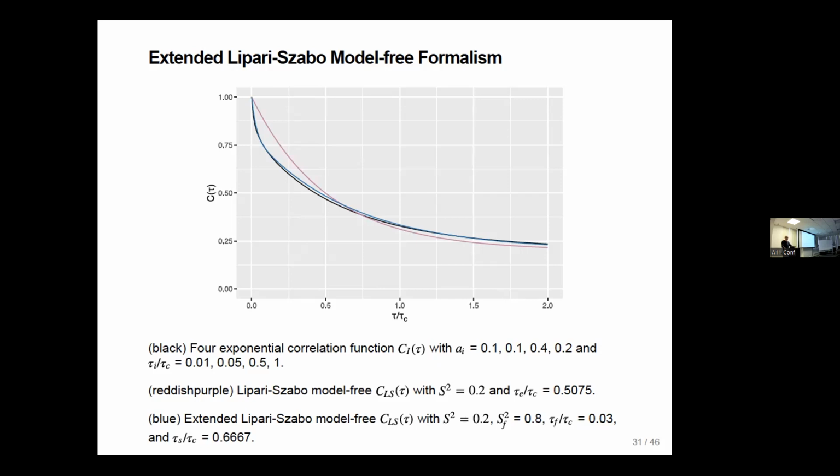So there's pretty good timescale separation. In the loops or the termini, one will start to see timescales of a couple of nanoseconds. And there it starts to get a little bit unclear how much timescale separation there really is.